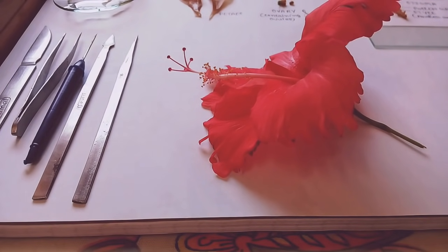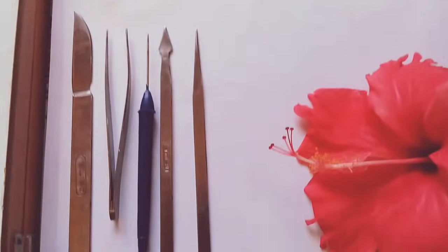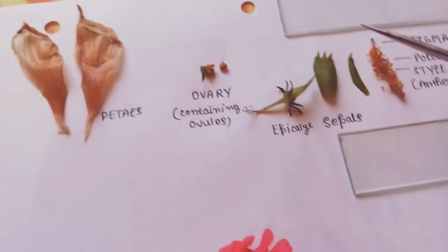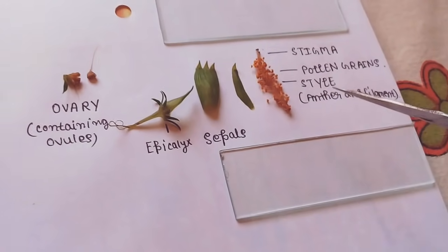Hello everyone, this is a demonstration video on the dissection of hibiscus. For this we need the regular tools which we use in our dissection box and a freshly plucked hibiscus flower. Hibiscus is known as Hibiscus rosa-sinensis or China rose, which belongs to the family Malvaceae. As you can see, I have already taken out the petals, the ovary, epicalyx, the sepals, and this is the stigma, pollen grains, and style.